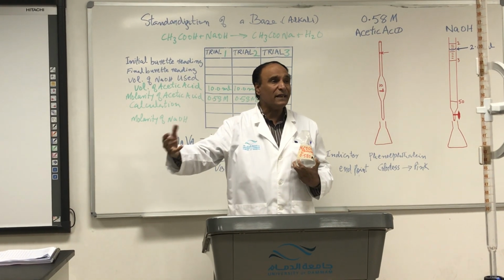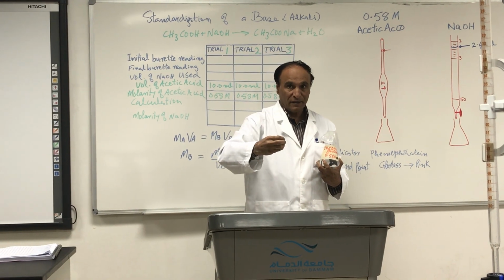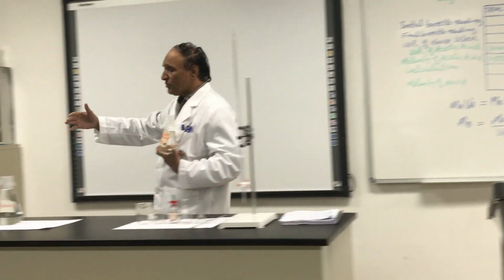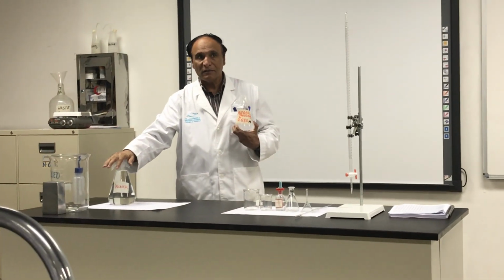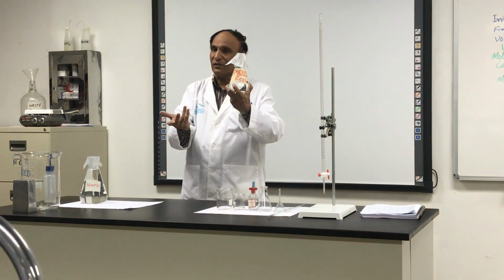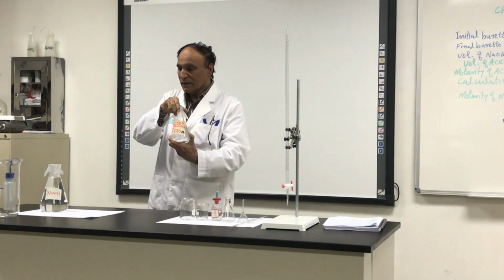Titration is a technique. It is a method by which we can find out the concentration of a solution with the standard. Standard means a solution whose concentration is known. I know what the concentration is. Alright?